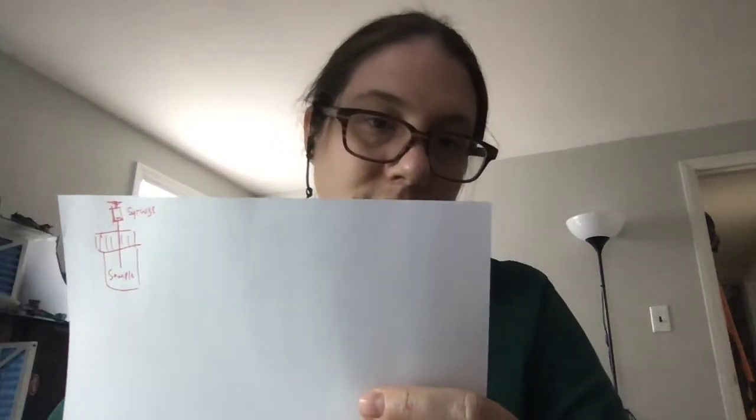And so what we're going to do is take our syringe and take a little bit out of that sample. So here's our syringe. I'm going to draw a syringe. And then we're going to take that syringe and put it in an instrument called a high pressure liquid chromatograph. We're going to perform high pressure liquid chromatography.